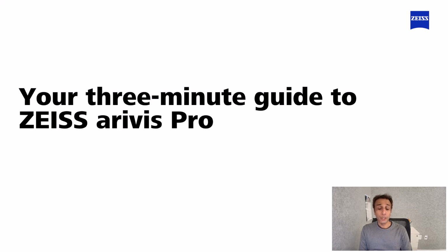This video provides an overview of ZEISS arivis Pro so you can get started in under 3 minutes.